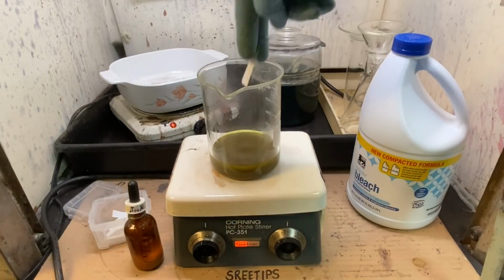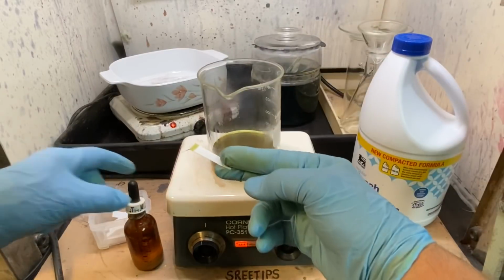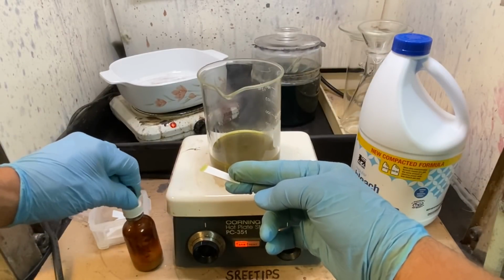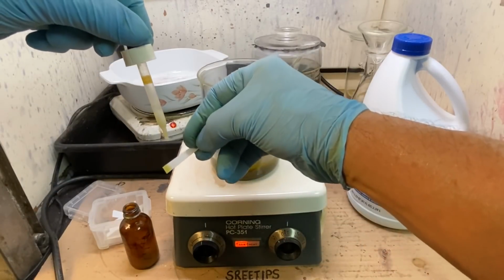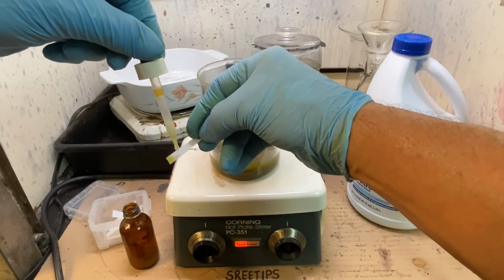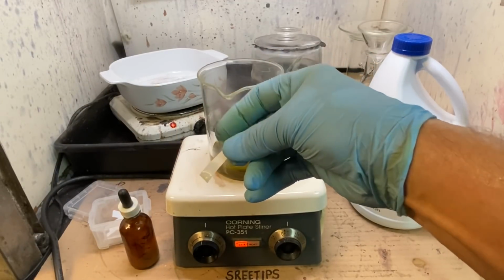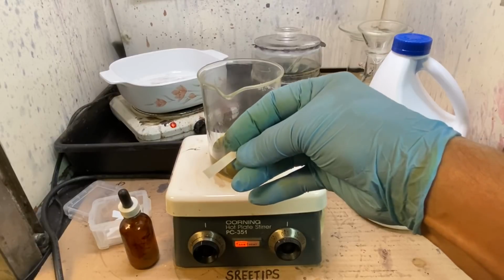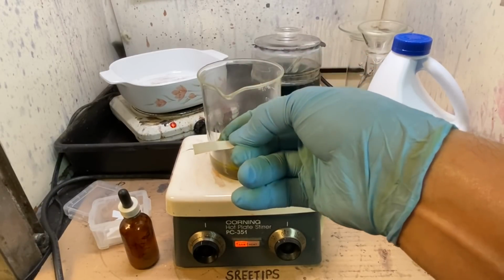Right now we've got some hydrochloric acid in there with it. Get a little bit on this test strip, piece of filter paper. Now what we're going to do is test this, see if we've got any gold going in the solution. I do see just a touch of a reaction there. Not much.